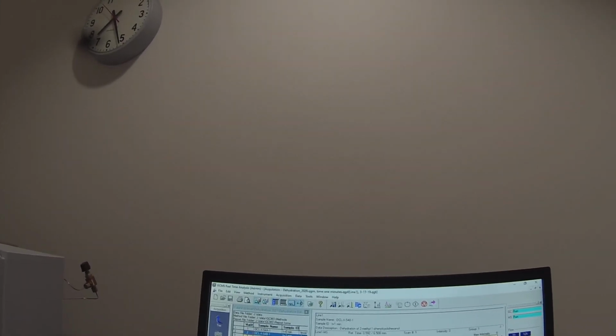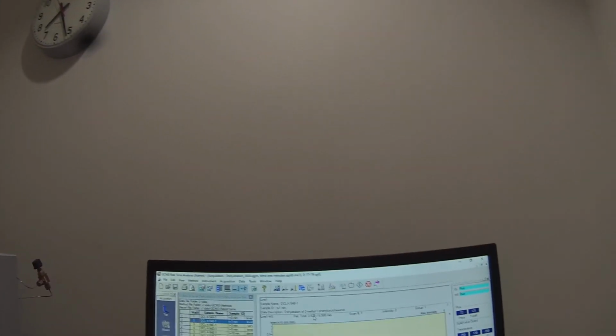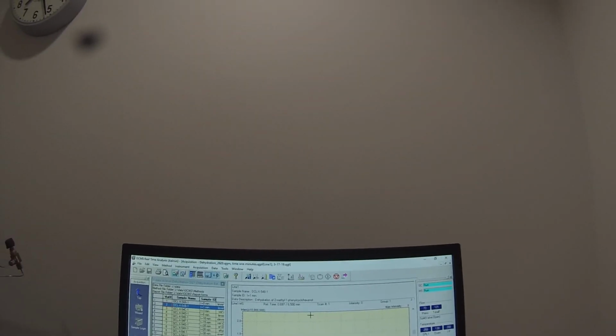Anyway, this is just going to continue now. It's running the time equals 1 minute sample. It's 0.6 minutes into a 6.5 minute run. We're just going to let that run overnight, and then I'll process the data.